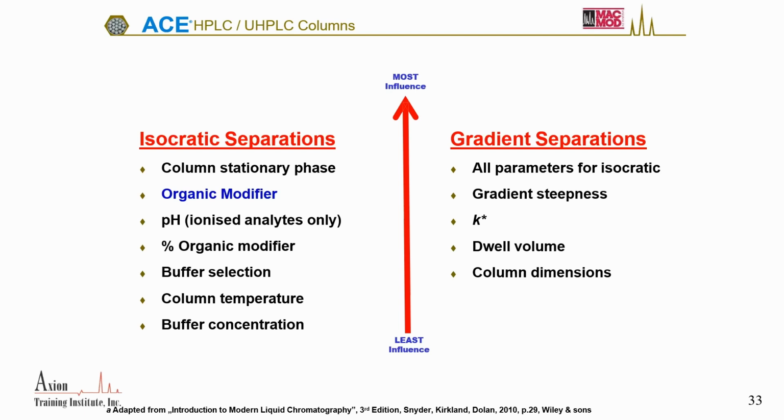So methanol is a proton donor, proton acceptor. Acetonitrile's got that triple bond hanging out there. THF is totally different than the other ones. So he said, if you change the mobile phase, the chemistry of the mobile phase, you're actually changing the selectivity.